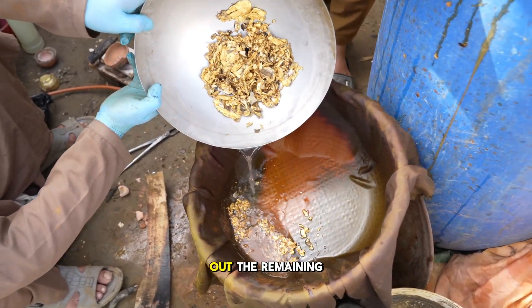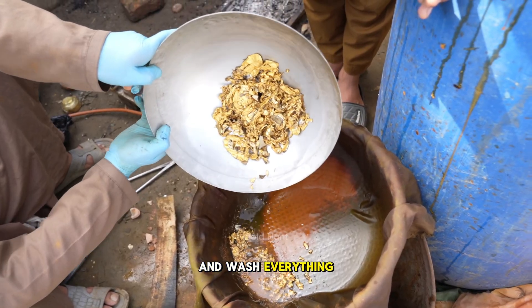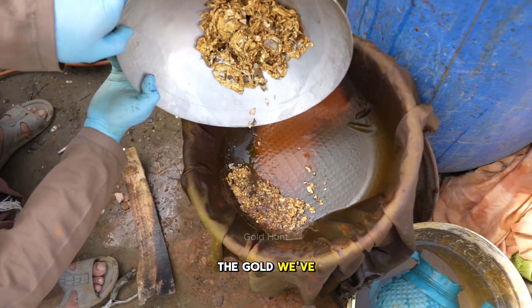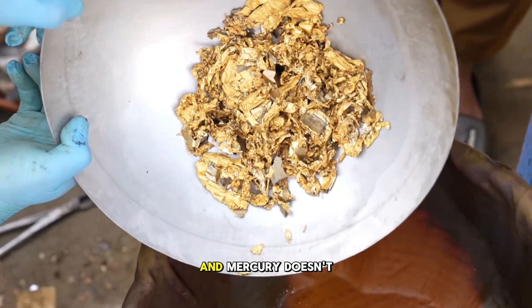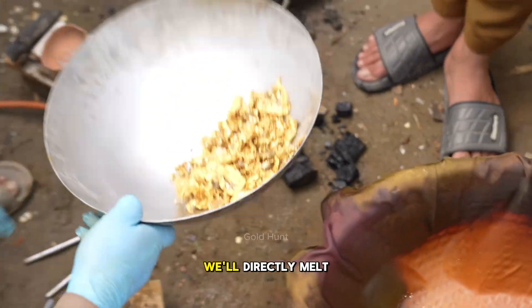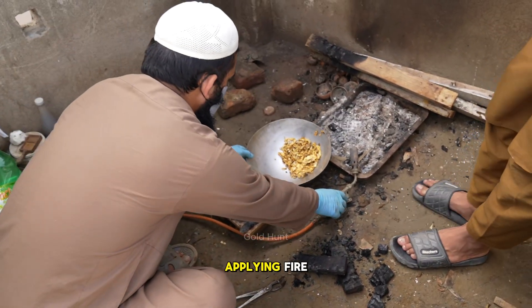Then, we'll pour out the remaining acid and wash everything clean. We won't use mercury in this step. The gold we've extracted is already in large quantity, and mercury doesn't work well with big pieces. So instead, we'll directly melt the gold by applying fire.